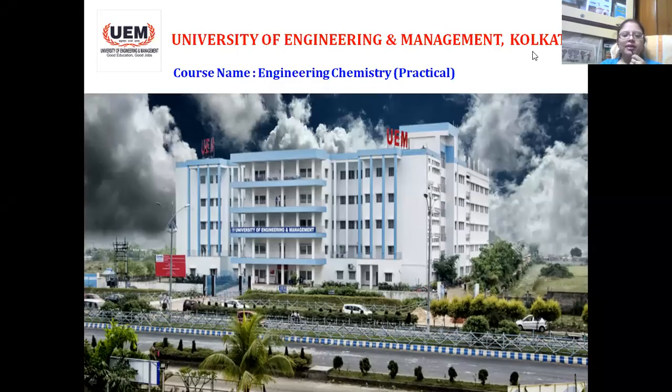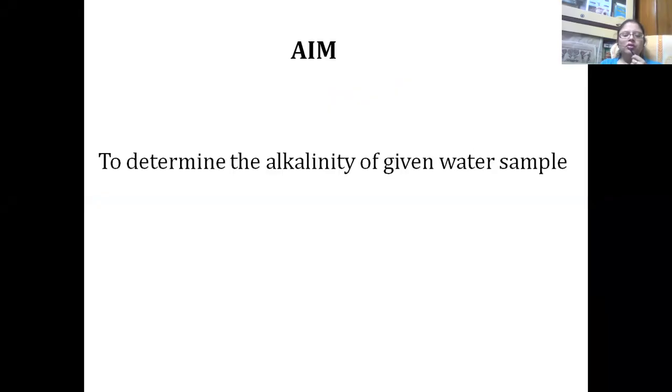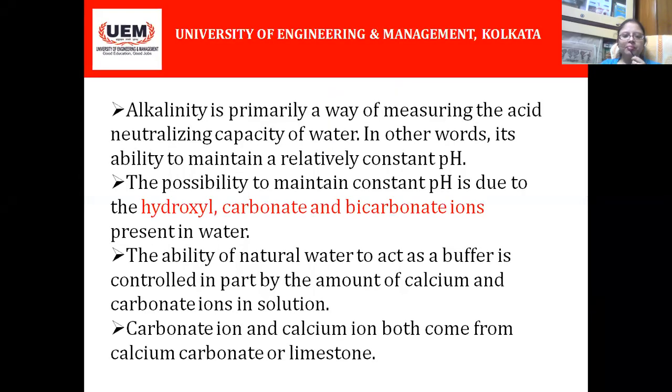Today I will discuss some practical session related to engineering chemistry. So today my topic of discussion is experiment on determination of alkalinity of water. So what is our aim? Our aim is to determine the alkalinity of a given water sample.